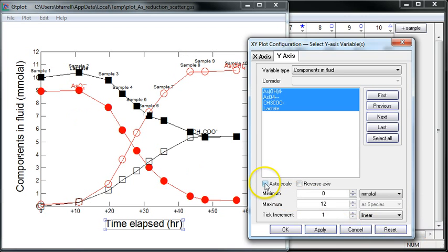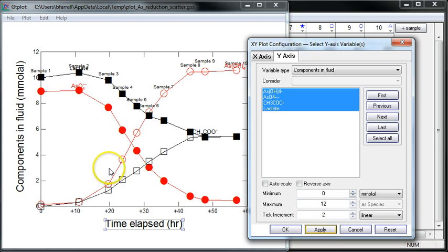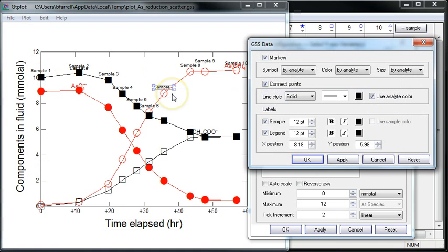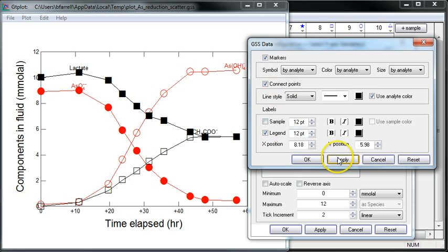Removing the autoscale, I can change the tick factor. Just make the plot a little bit nicer looking. I'll get rid of these sample labels by unchecking sample under labels here.